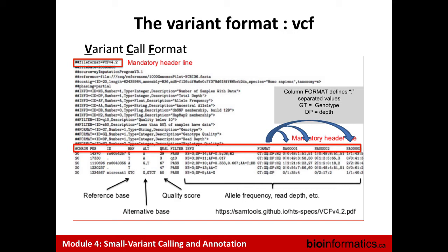When you are calling for structural variants, does the same approach apply? What do you mean? I think what you've explained is more of a small variant. So when you're doing large variants, like the structural variants, is it the same approach? For the variant call, no, it's a completely different approach and a completely different method, and we'll see that later this morning.